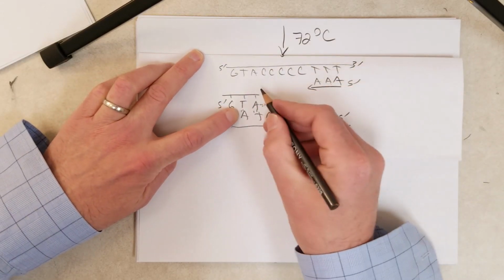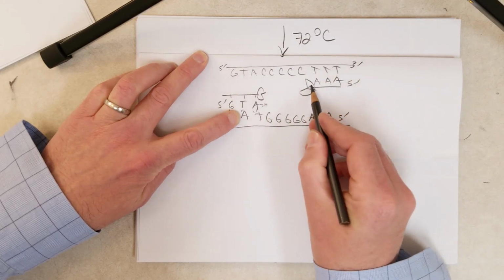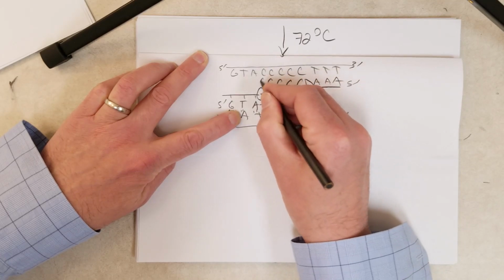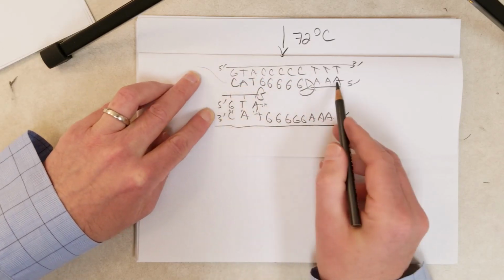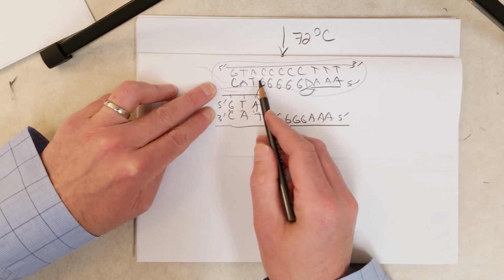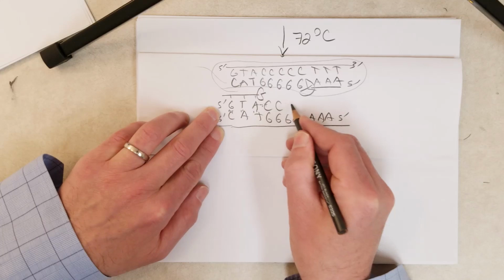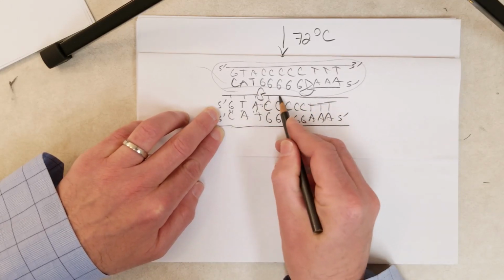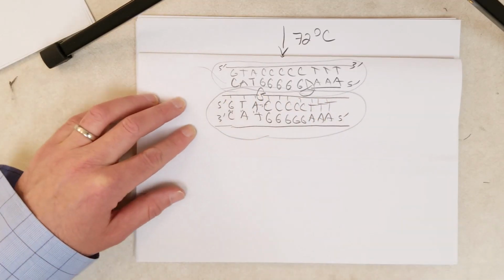And what happens is, now polymerase can come on here and it can extend these 3' ends. G, G, G, G, G, T, A, C. And if it gets to the end, there's no more template, the polymerase can fall off. And look, we have a full copy here, another copy of that DNA molecule. Same thing, it can extend this one, 5' to 3' direction. C, C, C, C, C, T, T, T. Okay, we've got another copy of the DNA molecule.